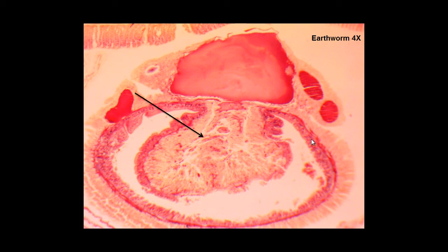Now we're going to look at this structure inside of the intestine called the typhlosole. Its sole purpose is to increase the surface area inside of the intestine to increase the absorption of nutrients. The last thing we're going to look at is the intestine, which is a complete digestive tract.